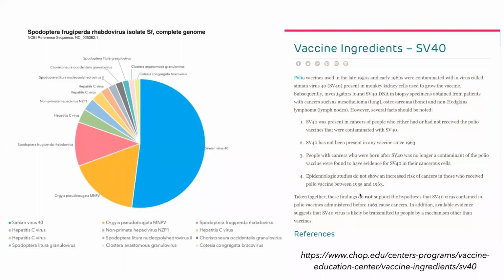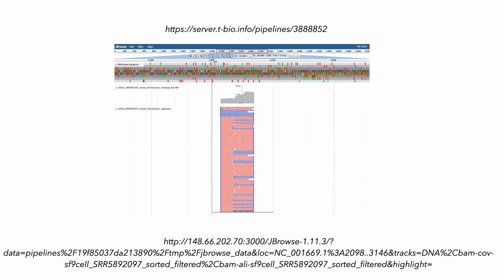So how do we know whether just the number of reads mapping on these references plays any role in the whole virus actually being detected? If we map the reads taken from that whole project onto the SV40 reference, you can see there's a lot of them, like 15,000 or something like that, but they only map to a very short segment right here, and they are just stacked.